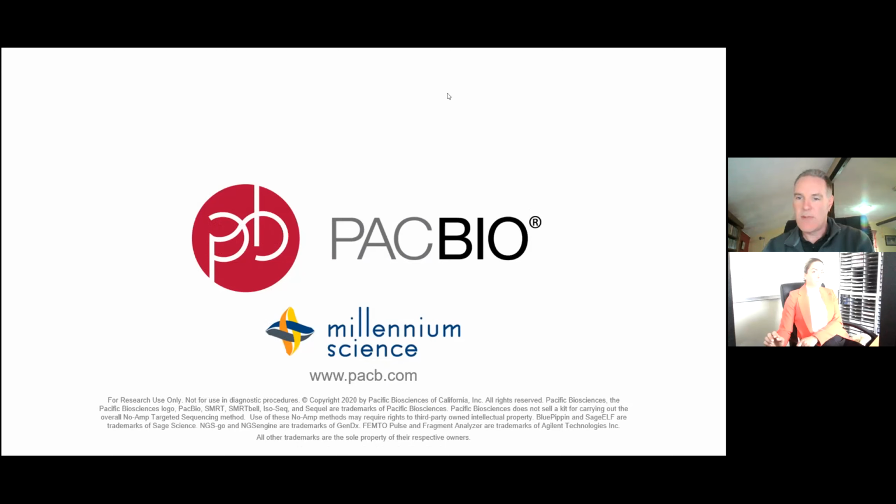Number of total reads based on the rarest. Roughly what percentage of genes could we expect to detect, protein genes of the rarest? What percentage of genes would we expect? Well, we're looking at being able to get not assemblies from every genome, but you'd be looking at getting a very, very good representation, maybe 5 times coverage. So you would hope that in terms of genes detected, you'd have a very high percentage of the total genes that are present from your metagenomic screening. So from the functional analysis point of view, you'd hope to get close to completely what's there. So I hope that answers your question, Paula.